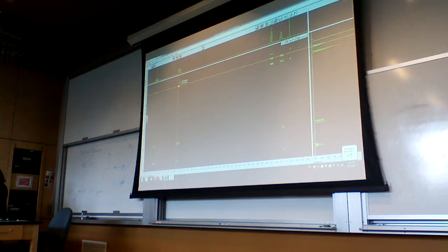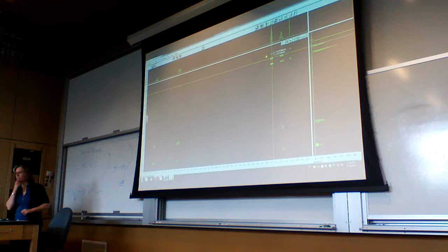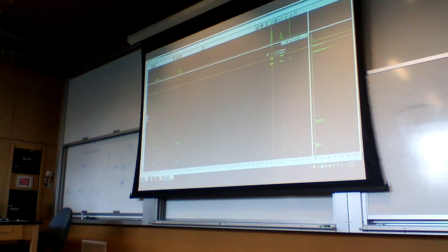So we can see that same coupling between C and F, then C and E, as we drag that along. And we see coupling between C and B. And so C is rather a promiscuous peak, coupling with all the other ones. We have C and D.